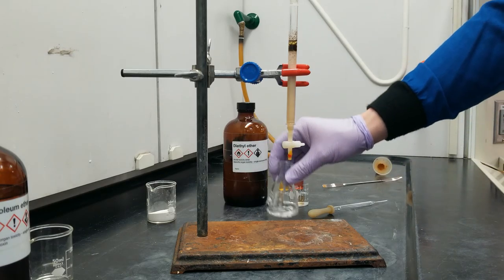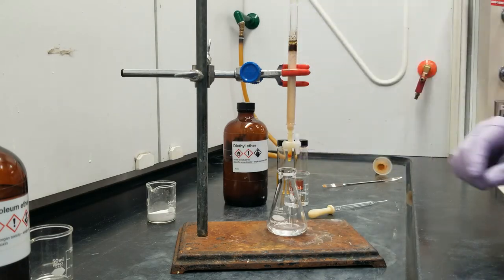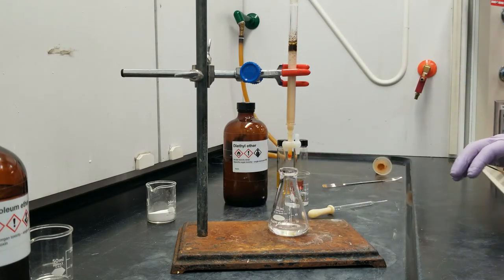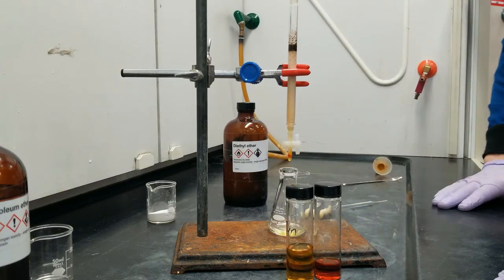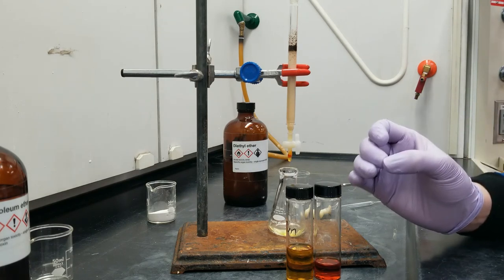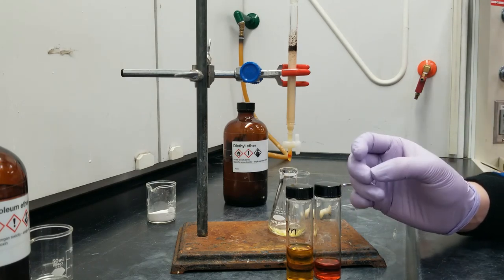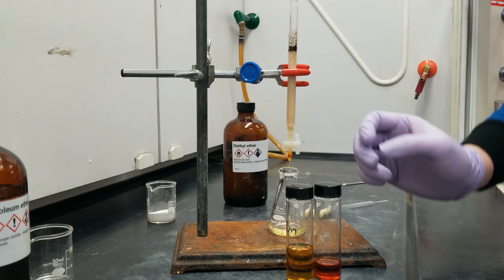Let's go ahead and just collect the rest of the solvent as waste. And I will pour this into an appropriate organic waste container later on. The next thing that I'm going to do, which is probably also going to require a little bit of speeding up, is I am going to dry these solvents off of the acetylferrocene and ferrocene using an airstream.